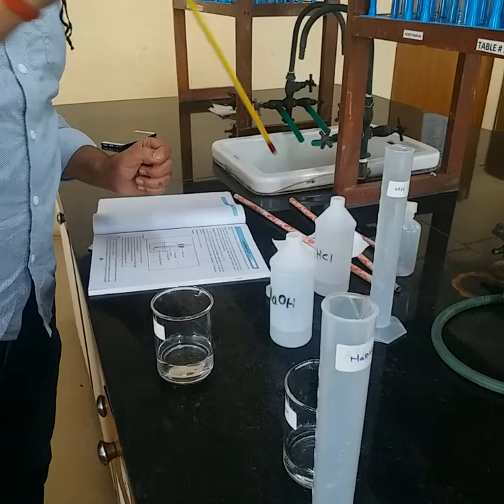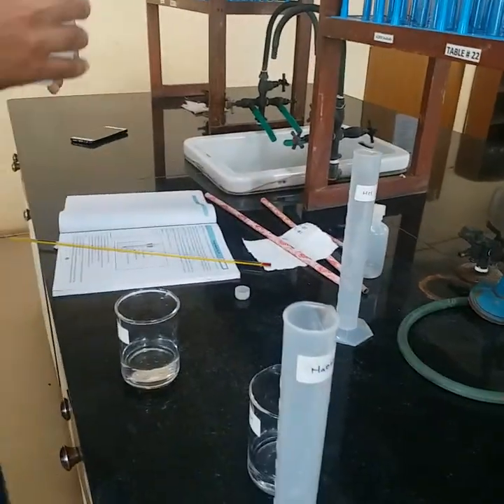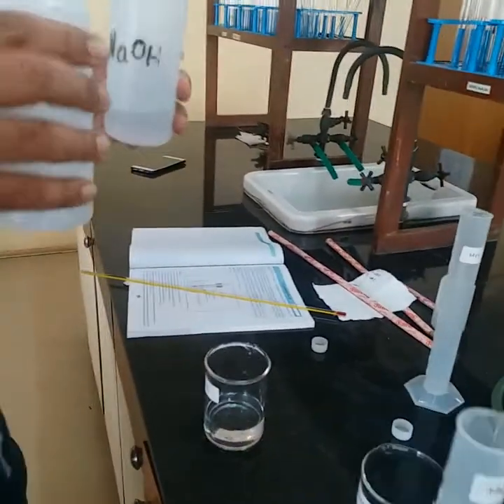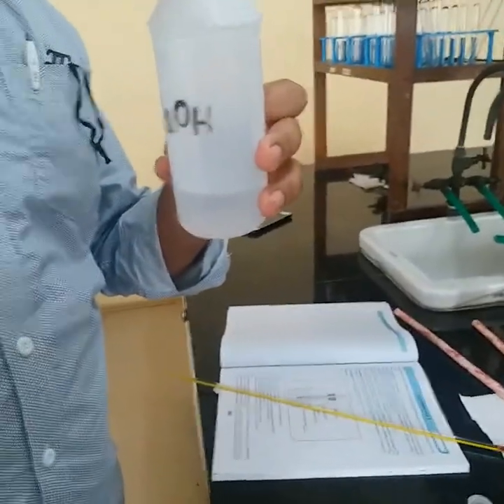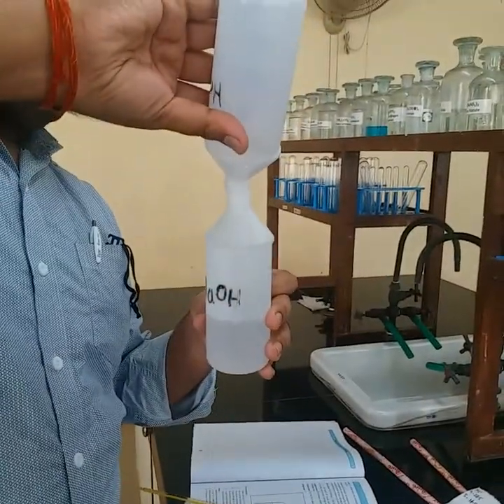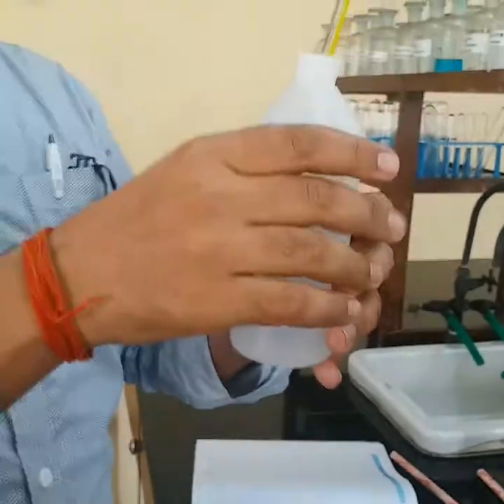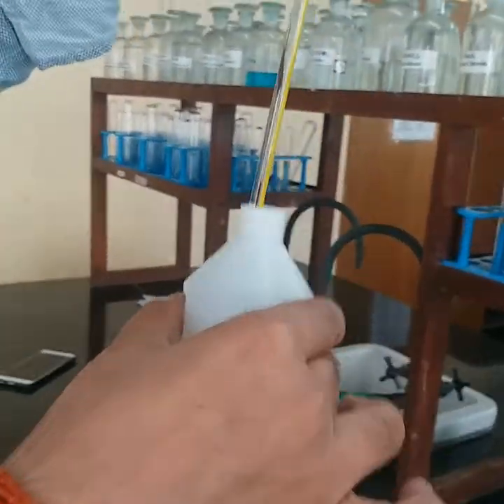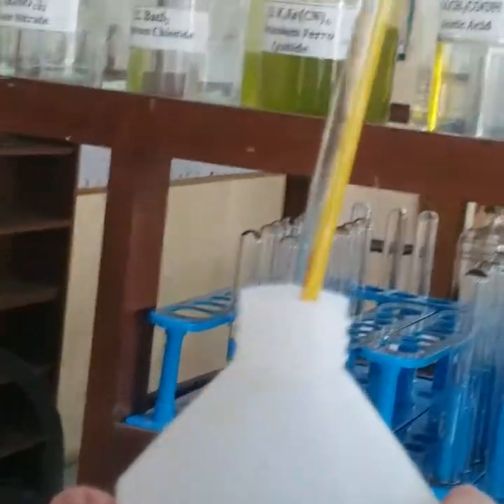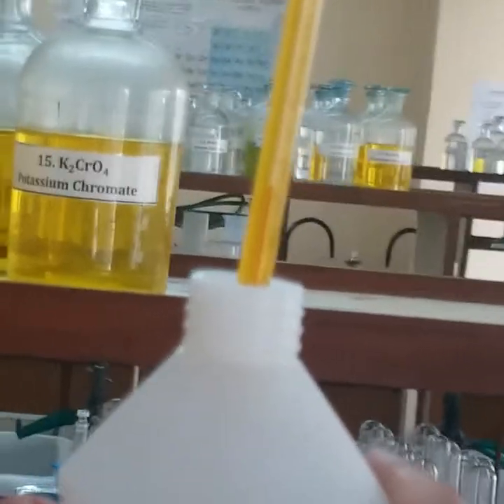Now the next step would be mixing. I will take the acid — HCl — and mix it into the NaOH. I will mix the HCl and then dip the thermometer into it. A little bit of stirring is needed. I will observe the rise in temperature, and that would be my T4. You can see it is exceeding 31, 31.5°C.